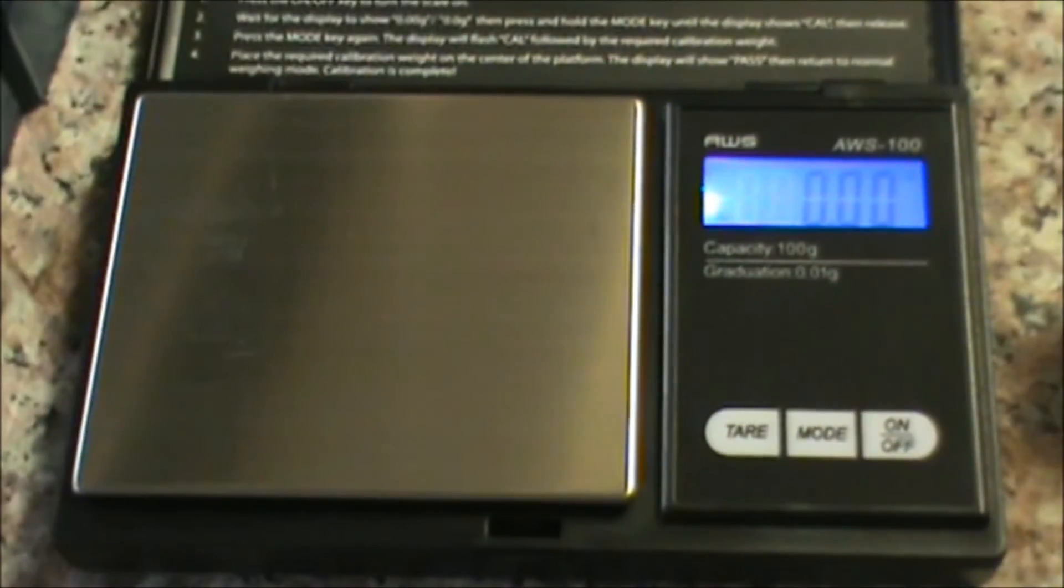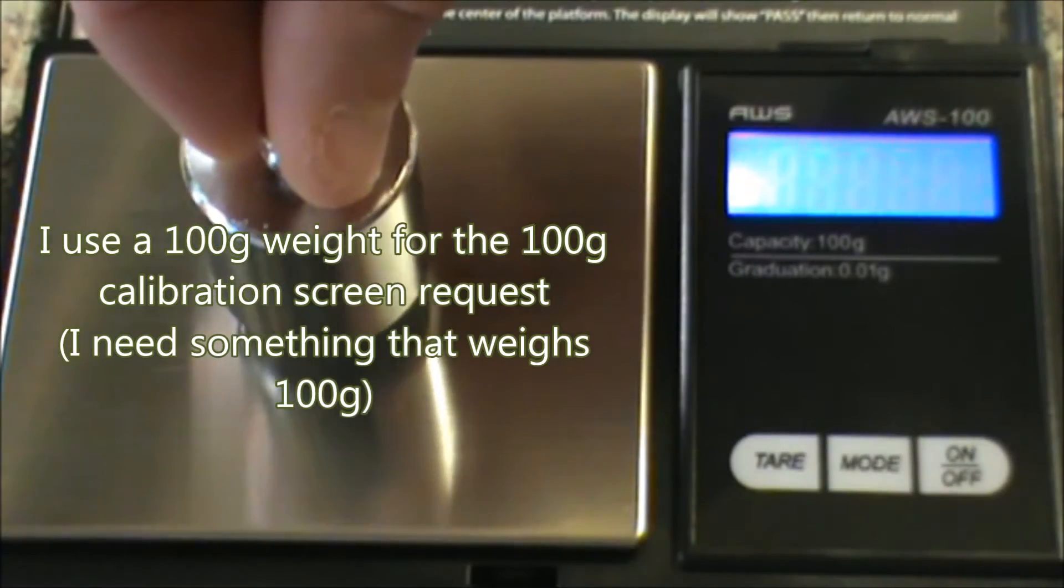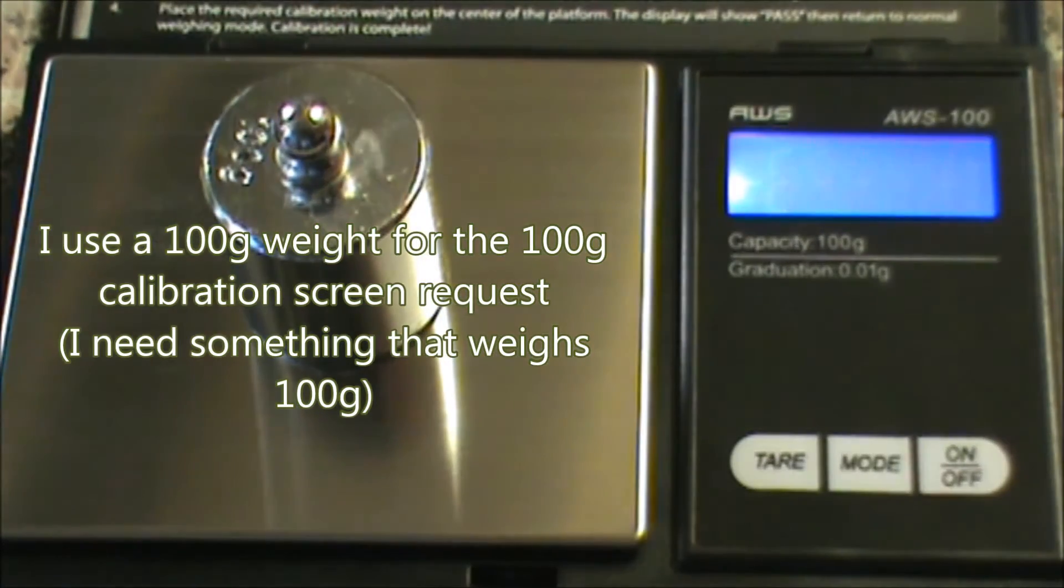So I'm going to calibrate it, zero in on here. We're at zero right now. I'm going to put it on mode, it's going to say CAL, and then I hit mode again and it's going to begin to blink. I'm going to put my calibration unit on, it says 100 and it passes.